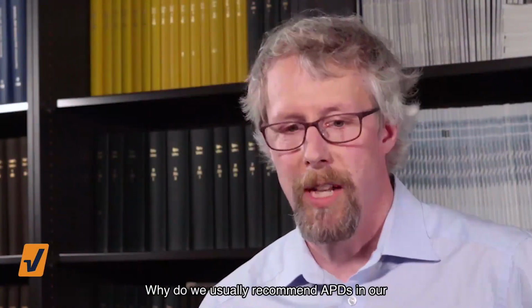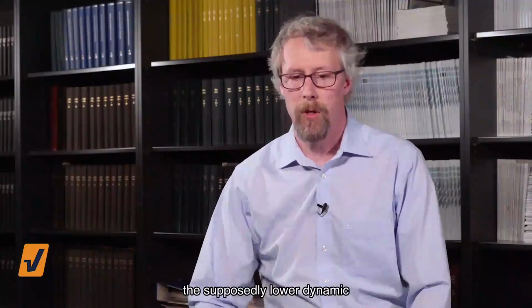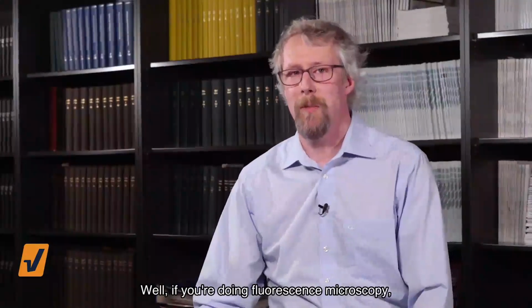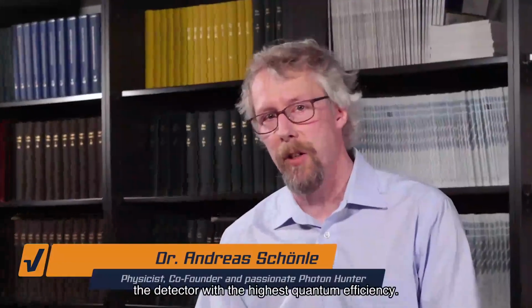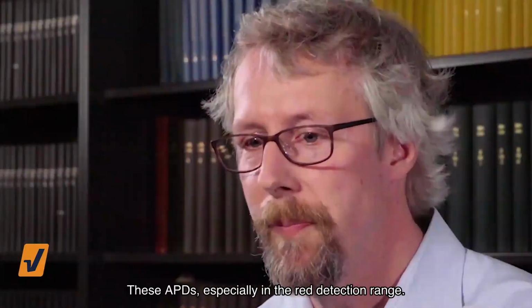Why do we usually recommend APDs in our microscopes, and why aren't we worried about the supposedly lower dynamic range of these detectors? Well, if you're doing fluorescence microscopy, usually your problem is not having too many photons. And therefore, in the vast majority of applications, the smartest choice is definitely the detector with the highest quantum efficiency. These are APDs, especially in the red detection range.